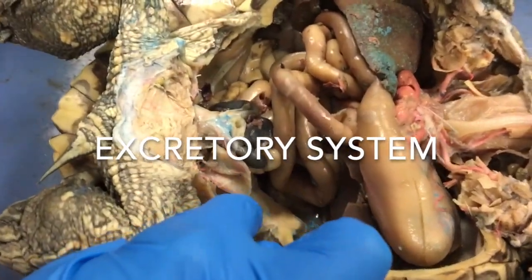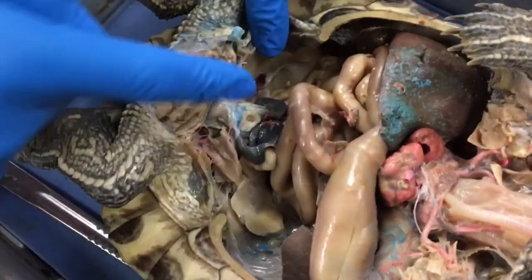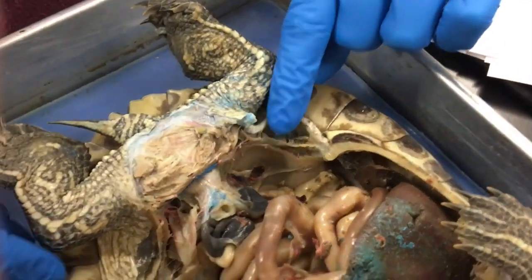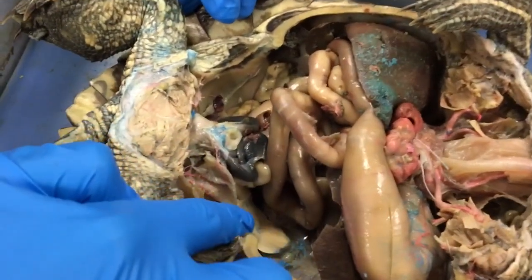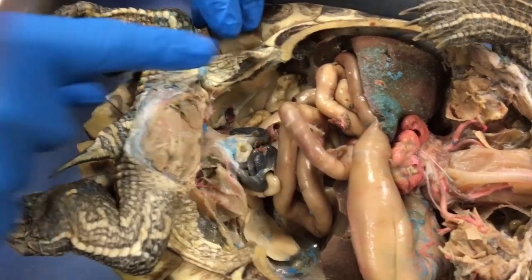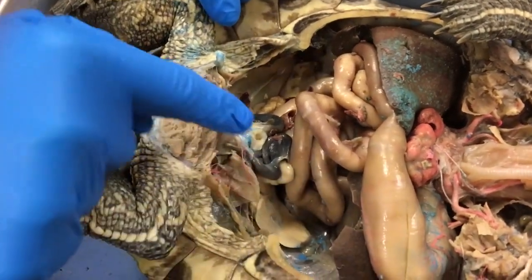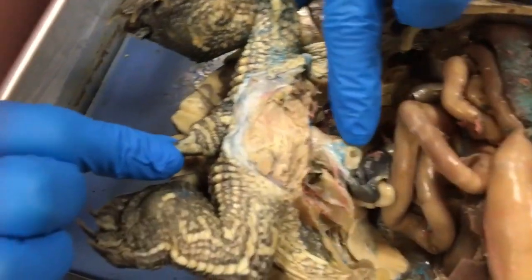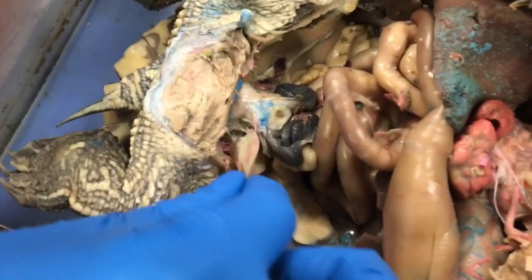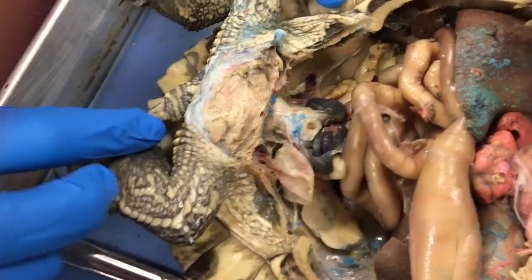The metanephric kidney is the turtle's main organ of the excretory system. Turtles have paired kidneys, and they remove wastes. Renal arteries and veins transport blood to the kidneys, which remove water and nitrogenous wastes from the blood. Water is often pumped back into the body while the nitrogenous wastes are concentrated into uric acid, which is then removed through the cloaca. The waste is stored in the urinary bladder until it is ready to be excreted through the cloaca.